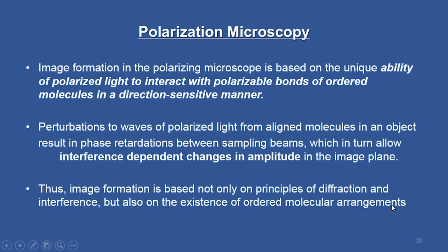So, polarization microscopy is again another classical case of interference microscopy, and if you look at the applications, it is primarily for a transparent sample, and it gives you very accurate quantitative results of optically sensitive constituents or optical properties of microstructural constituents in much more detailed manner compared to any other variants of microscopy. This is a unique feature in polarization microscopy.